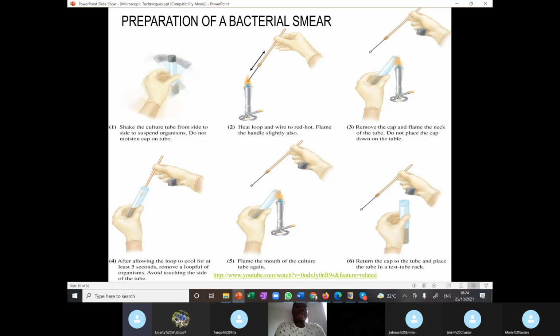So remember I said our lecture was divided into two sections. The first one was microscopy and the second section was staining. Okay, and I said when we stain, here we're really going to visualize with what? A light compound microscope. We are going to visualize with a compound microscope after staining here. So let's focus on staining in this segment.